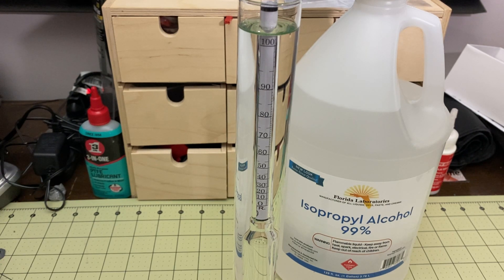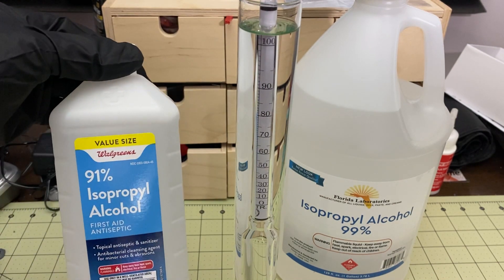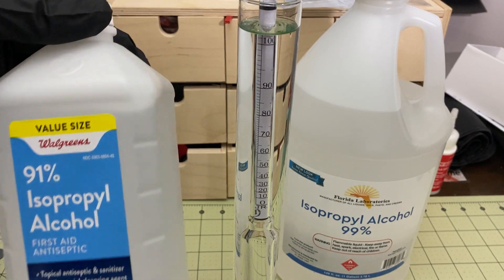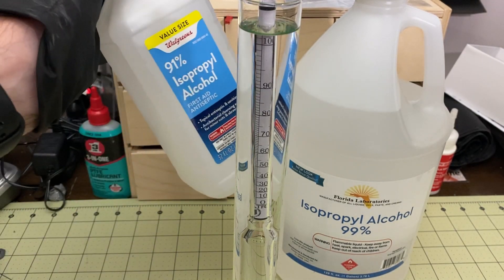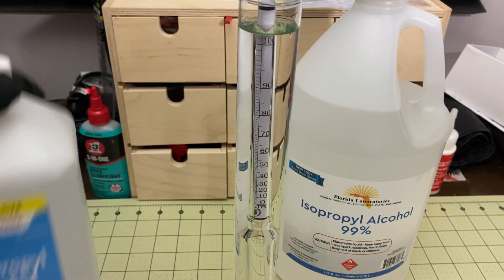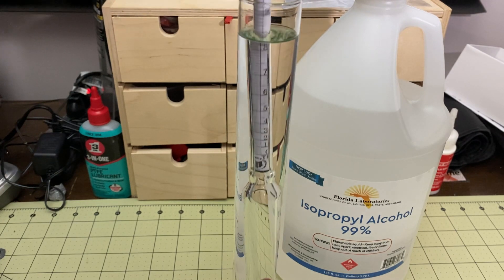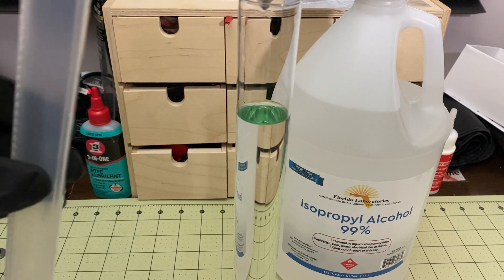This stuff cleans great — I've used one gallon and it worked out great, was super cheap. But since this is my first time using a hydrometer like this, I want to also test my 91% Walgreens IPA as a control to make sure the hydrometer is working correctly. I'll transfer the liquid over and do the same test with the Walgreens 91% IPA.